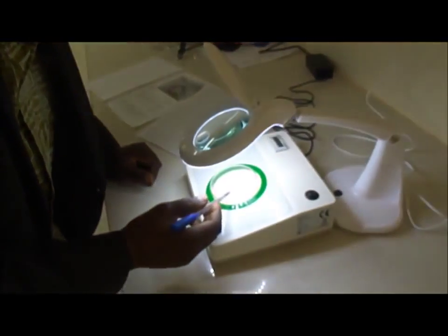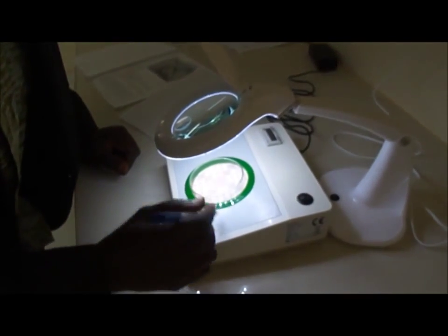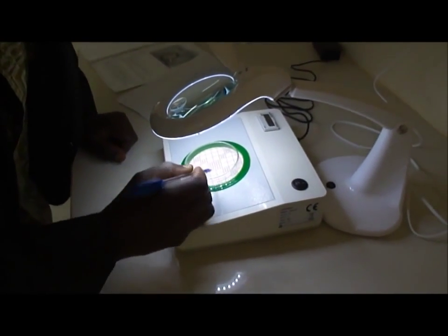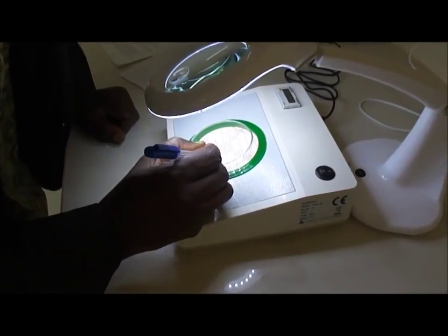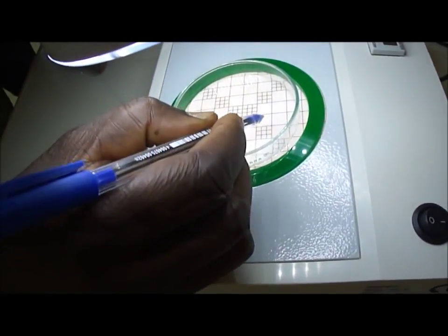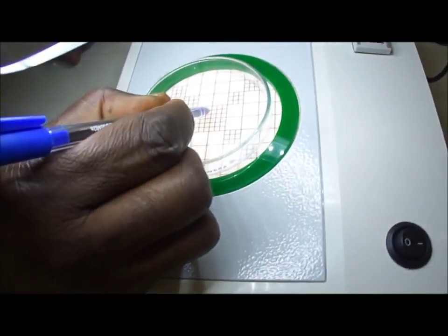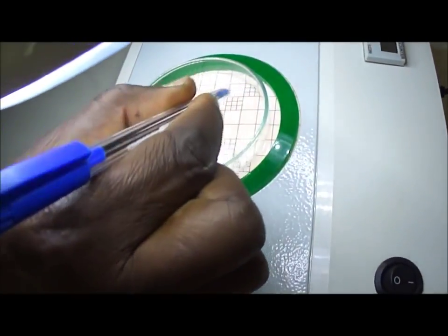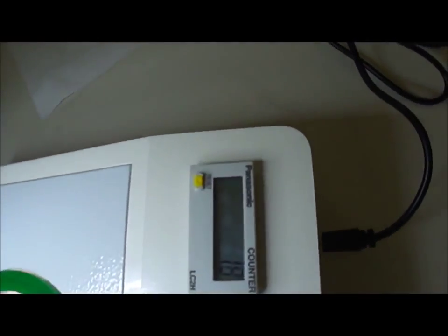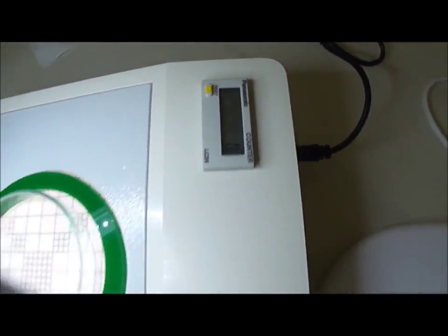Then you look inside the plate through the magnifying glass, and you can count now by just pressing at the bottom or the top of your agar. You can count the colonies much easier because you have magnified them, and the number is displayed in the counter. So this is very practical for counting the bacteria.